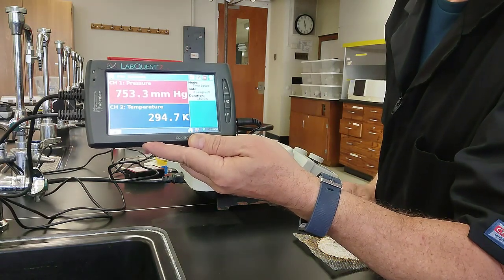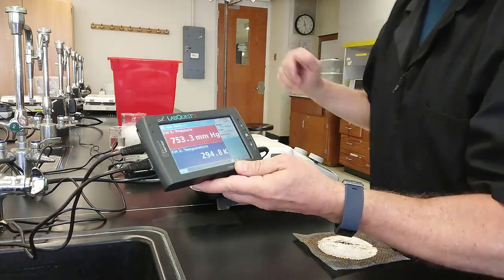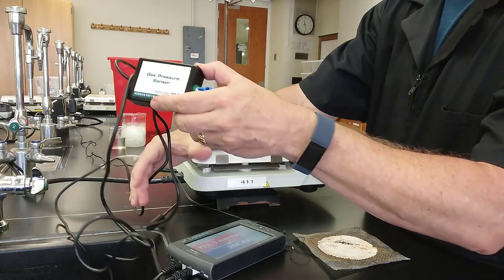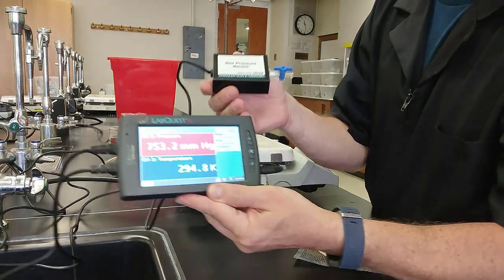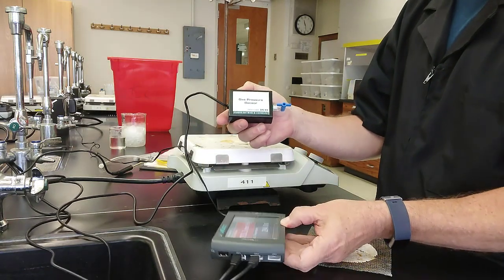It's just up to you to decide what you are going to record on your data sheet. Okay? So right now, with nothing hooked up to our pressure sensor, and me moving my temperature sensor out of the way, you can see that we have 753.3 millimeters of mercury.